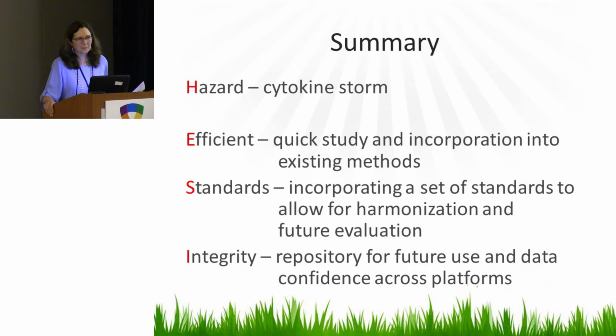The paper should make for some really good reading, because it discusses a lot of the inherent challenges between the variability in the biology itself, the variability in the molecules. What do you do if your target is only on activated cells? Well, how do you do an assay to see whether you're activating cells if the target's not on there, and if you activate them to make the target express, then you may get cytokine release just because you did that. So it's a pretty challenging question.